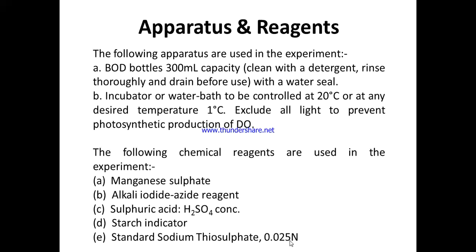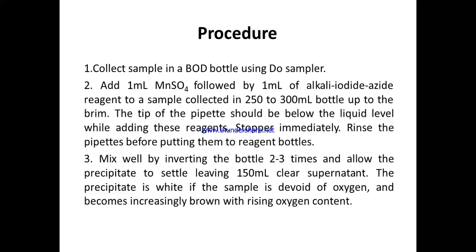as for dissolved oxygen. Okay. Now I will tell you the procedure and then I will show you the lab video that we have prepared for the BOD experiment. And the lab video will be basically determination of dissolved oxygen only. We will determine initially the dissolved oxygen level, then after 5 days we determine the final dissolved oxygen level, and then we just multiply it with the dilution ratio and we get the quantity of BOD that is present in the water sample.